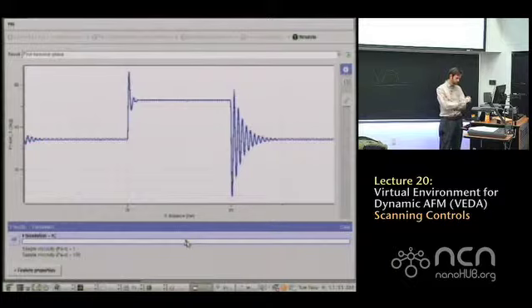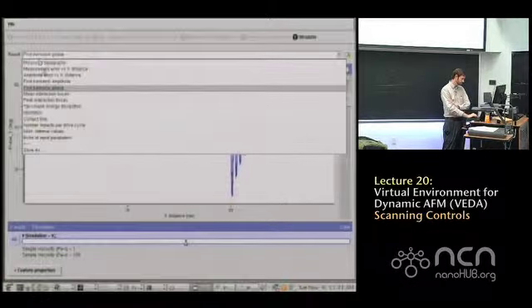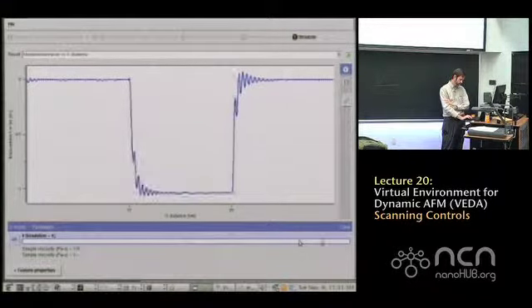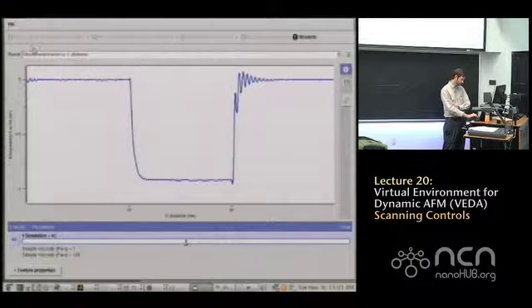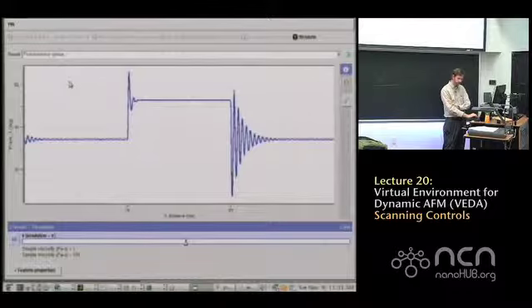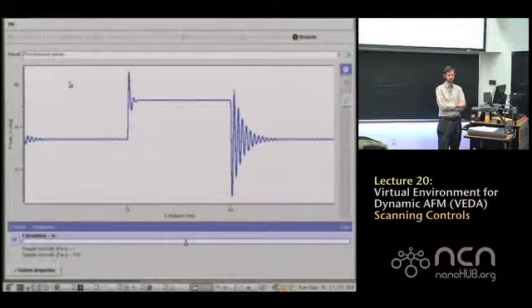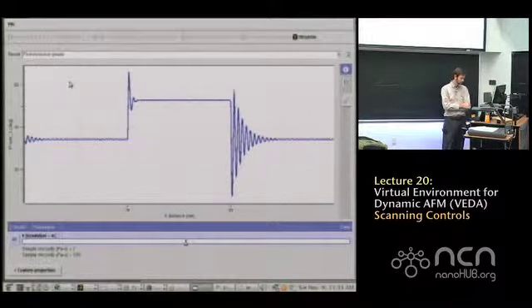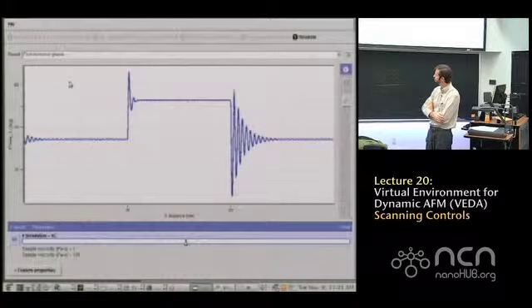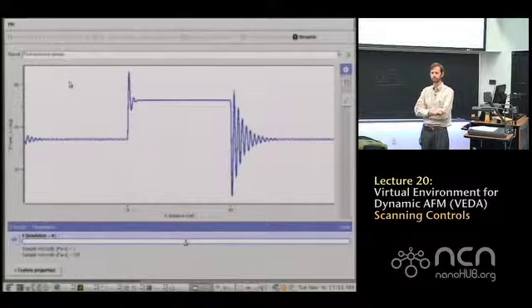So what you've done here is you define properties of the substrate and its features. What's the dimension of the feature? It's whatever the default is. Can you go back to the substrate? So I'm hoping everybody got something that looks kind of like that.